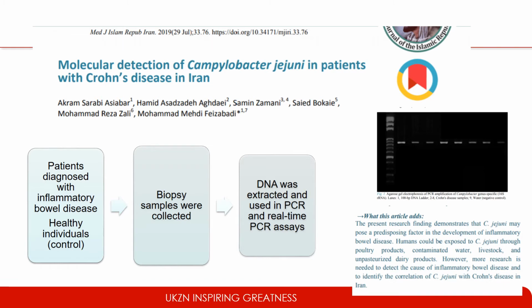More research is needed to detect the cause of inflammatory bowel disease and identify the correlation of Campylobacter jejuni with Crohn's disease in Iran. So using this simple molecular-based assay, you are able to draw correlations between infection and causative pathogen.